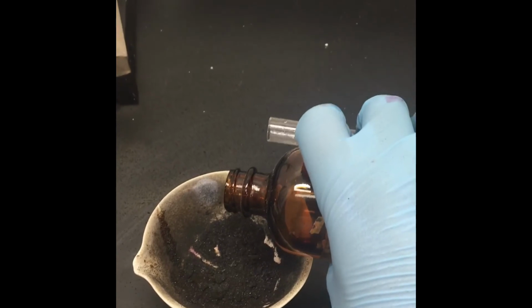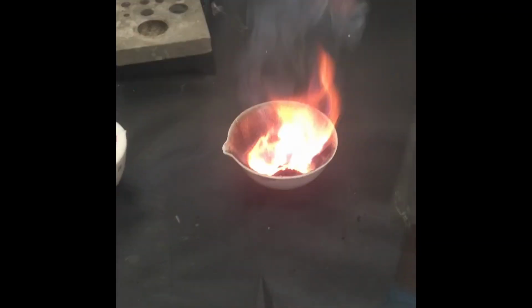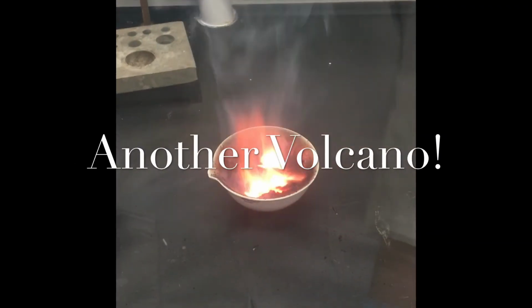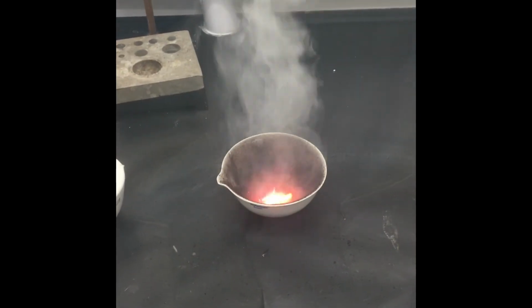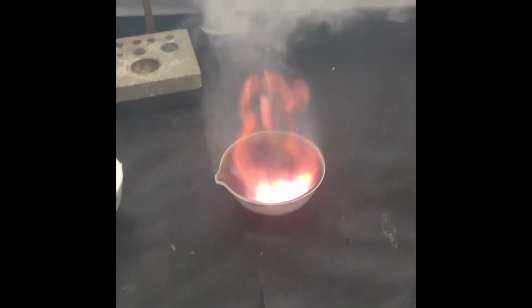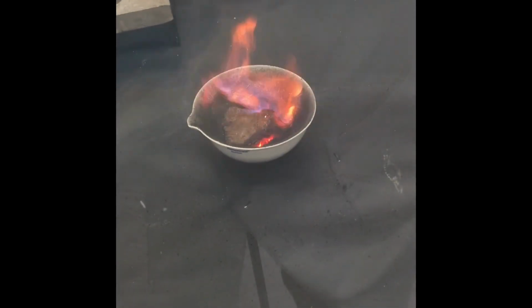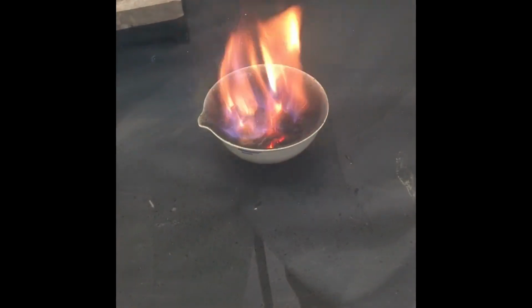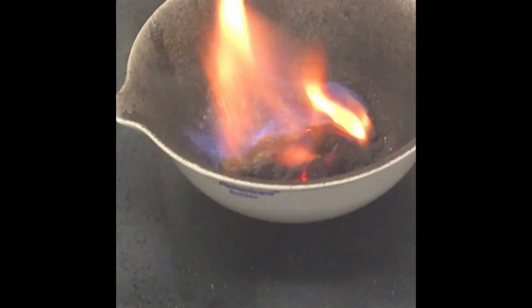I'm actually going to put some in here. Oh, there it is. And I'm closing this. Oh yeah, look at that. Beautiful. I'm wearing this to make sure that I don't breathe any of that. Oh, look, there you can see the fireworks. Look at that. Beautiful. Can you see those little sparkles? Wow. This is the chemical volcano.